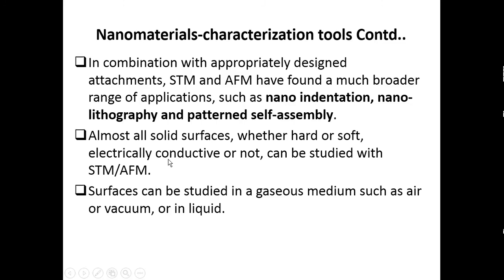So these two types of microscopes can be used whether the specimens, meaning solid specimens, are hard or soft, electrically conductive or not, and the surface characterization can be done with the help of these two types of microscopy.